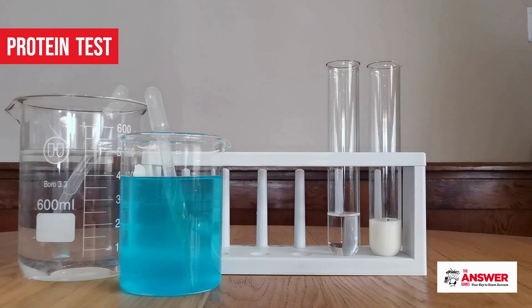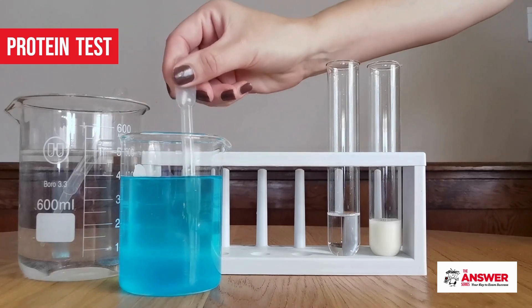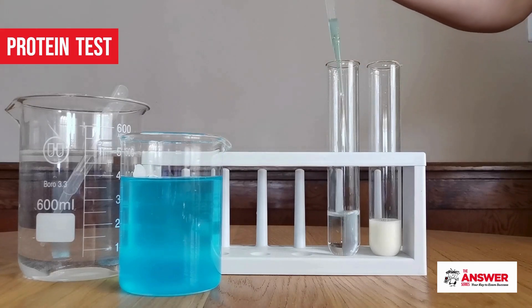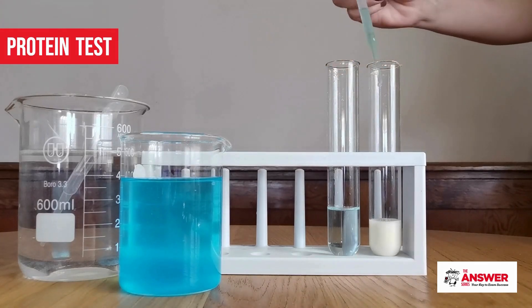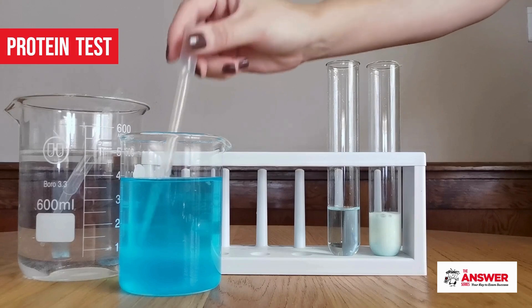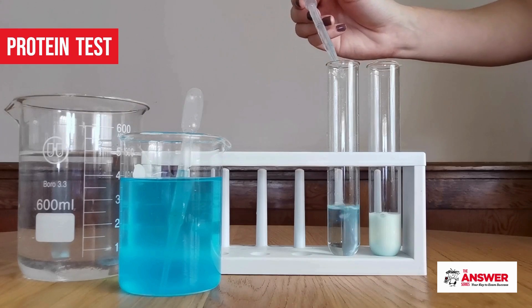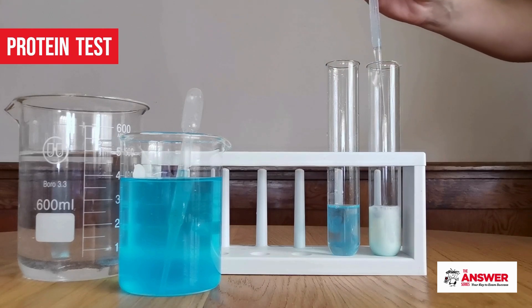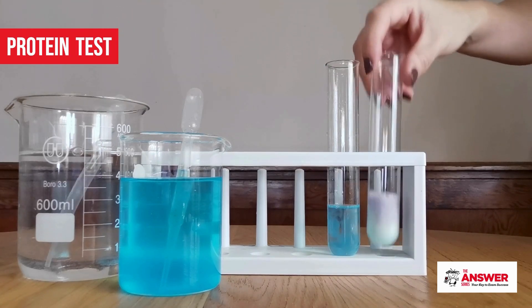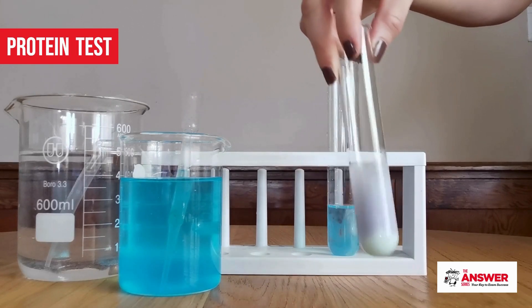To perform the protein test, add some milk into one test tube and water into another. The water will again serve as the control. First, add a few milliliters of Component A, the copper sulfate solution, to each test tube. Then add a few drops of the strong alkaline Component B, the caustic soda solution, to each test tube. Gently shake the mixtures to allow the two components to interact and disperse, and observe the color change.